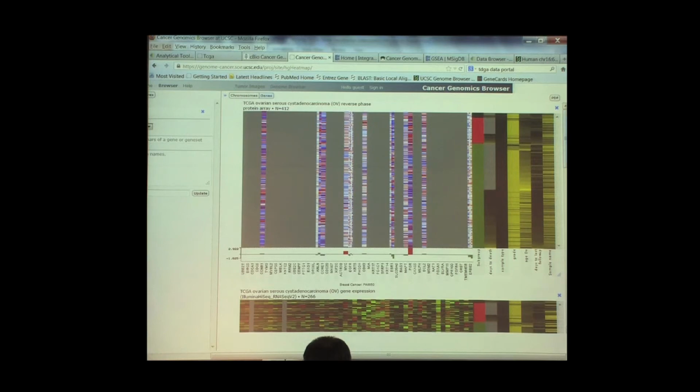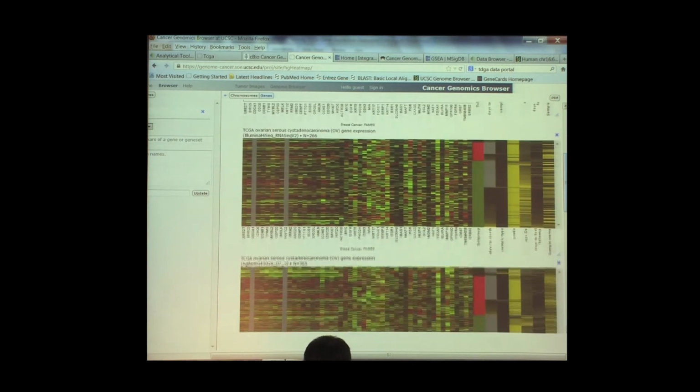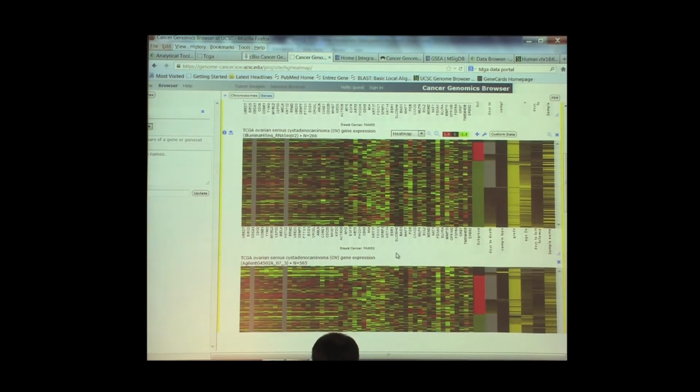All right. As you look down, you'll see that we assigned it for protein, but we didn't assign it yet for the expression data. So we don't have the comparisons done for the expression data, the mRNA level stuff. So go into that and tell it, you don't have to reassign these. The assignment's already been made. You just need to tell it to show you the statistics. So go through and do that for every data set.